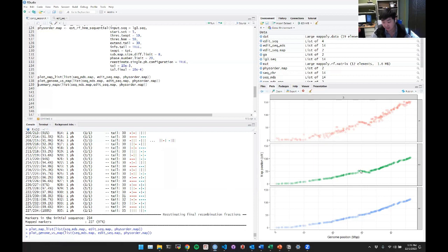You still see it there because it doesn't actually change the order of the genome. But as you see here, it looks like it just mapped completely through it. You don't see that here. This is when we just map completely through it. MAPpoly just makes little changes to the dosage calls, and it tries to fix that area, and so you don't see that inversion. So to actually see the inversions, a lot of times you have to use MDS. You won't see it if you just try to map through it, because MAPpoly will either kick out the markers or try to make fixes to the genotypes to make it fit the map.